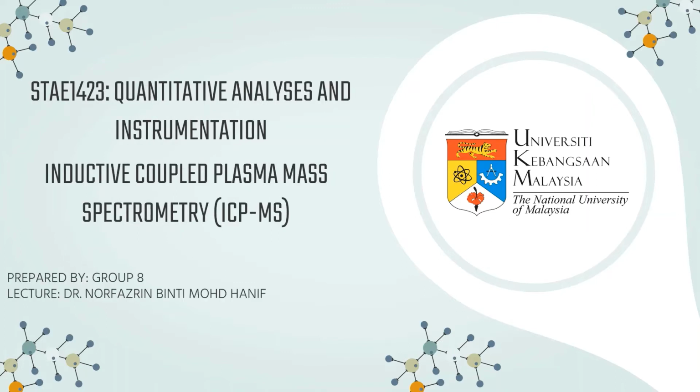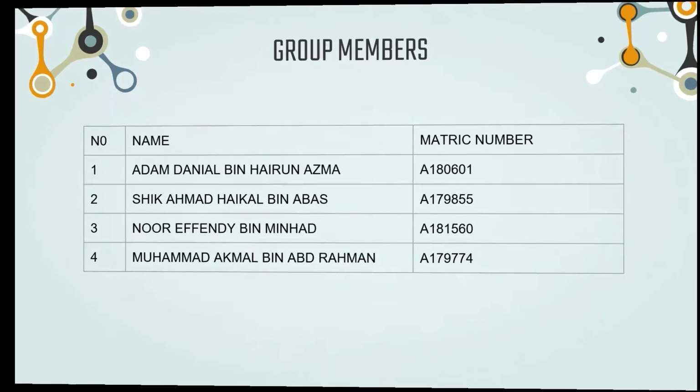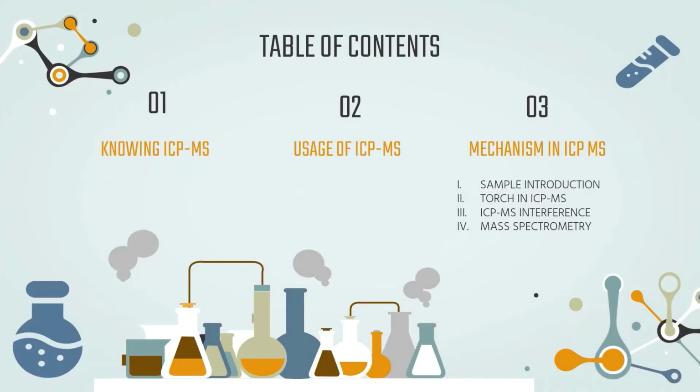Today, we from Group 8 want to present about inductively coupled plasma mass spectrometry, also known as ICP-MS. Our group consists of 4 members: Adam, Haikal, Effendi and Akmal. This is what we're going to discuss about ICP-MS.